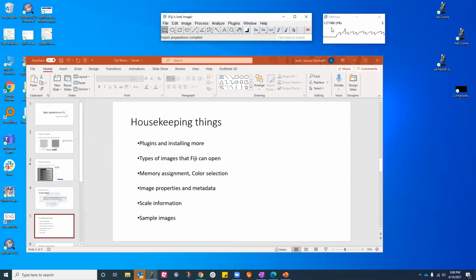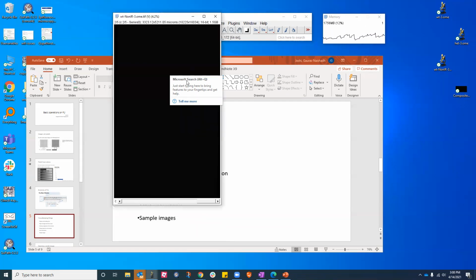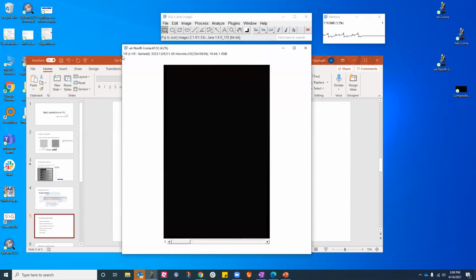All right, so it used up to 1.5 GB of memory. And that's because the file size is 1.5 GB. Okay. So this is, again, a good point to look at what's part of the image, right? So if we go back, it says 1/5, and this is how things were organized.